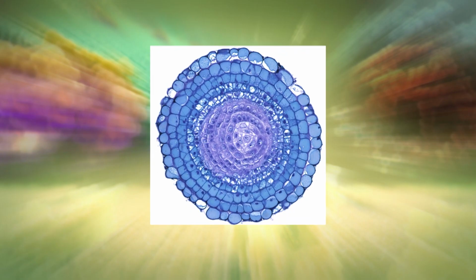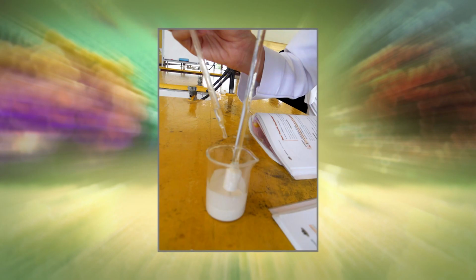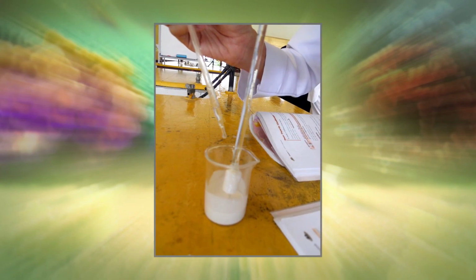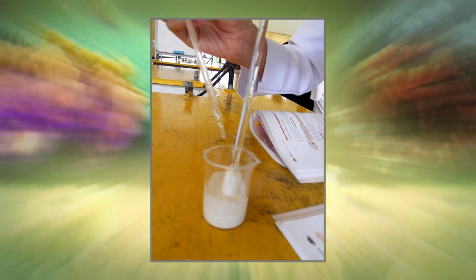The broad objective of tissue fixation is to preserve cells and tissue components, and to do this in such a way as to allow the preparation of thin stained sections. In performing their protective role, fixatives denature proteins by coagulation, by forming additive compounds, or by a combination of coagulation and additive processes. A compound that adds chemically to macromolecules stabilizes structure most effectively if it is able to combine with parts of two different macromolecules, an effect known as cross-linking.